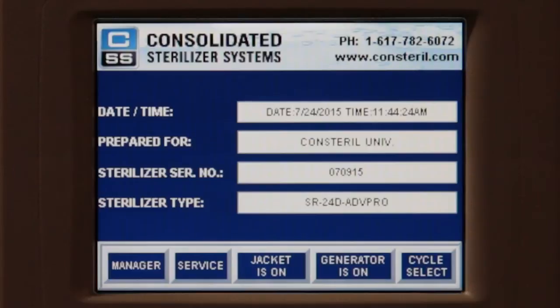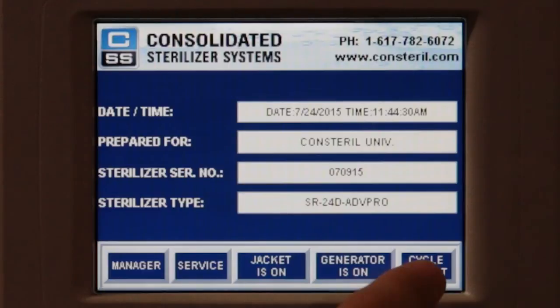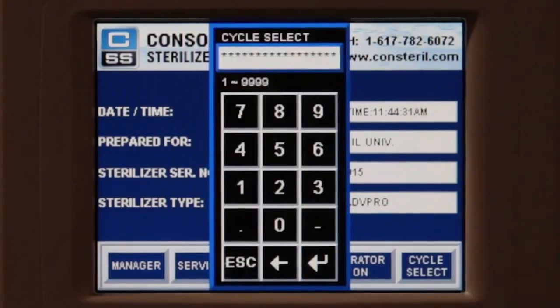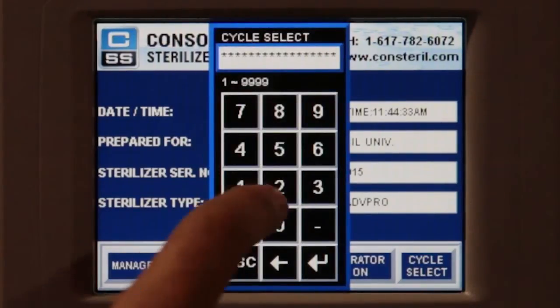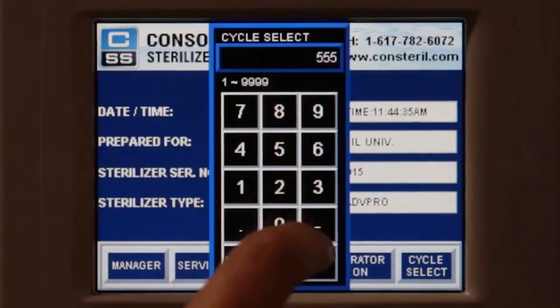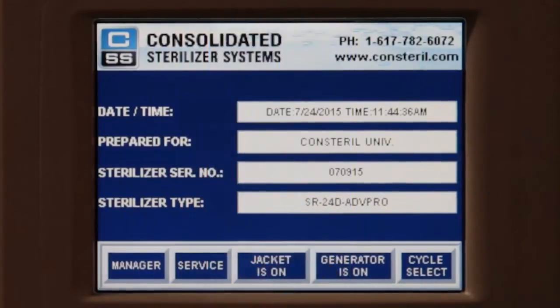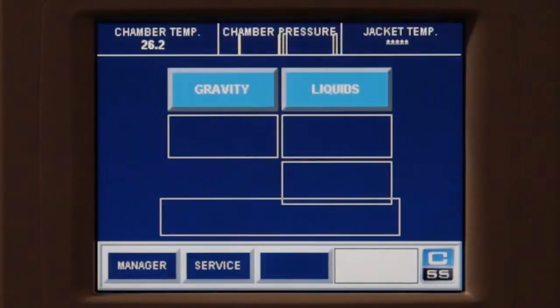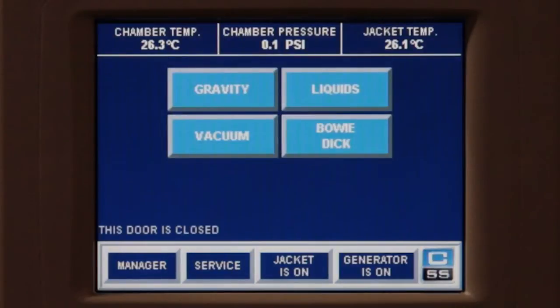To select the gravity cycle on an Advantage Pro control system, press the cycle select button on the main menu. Enter your operator passcode on the number keypad and press the enter key. Select the gravity option.